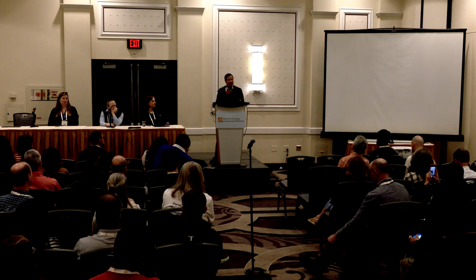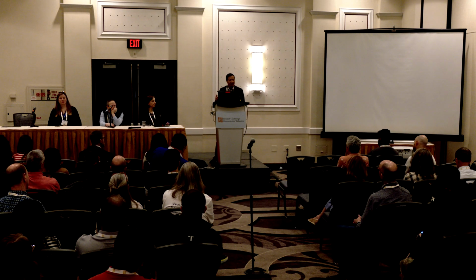And so I just want to share some of our experiences and our philosophy around data management and some of the strategies we've taken. First of all, I think data management doesn't have one definition. It has so many definitions. And I like to think of data management in terms of both strategy and tactics. And when I talk about strategies, data management has a goal. So the overarching goal, as we're all familiar with, is that data management supports rigorous and reproducible science to advance fundamental biomedical discovery. And that's the overall concern.